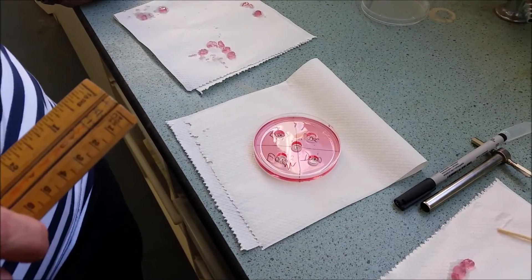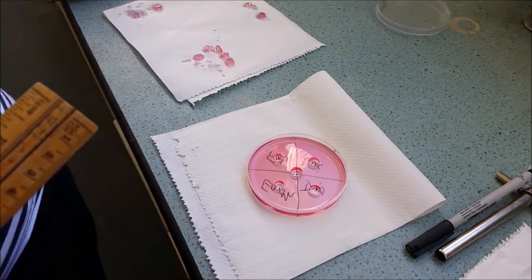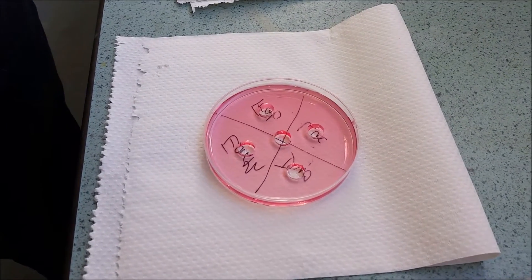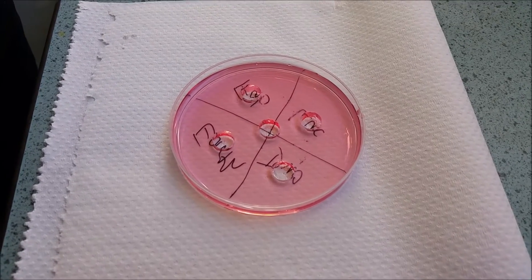Once the holes have been drilled, the wells have been created and before you put your laundry detergent in it's really important to remember to measure each of the wells using a ruler.